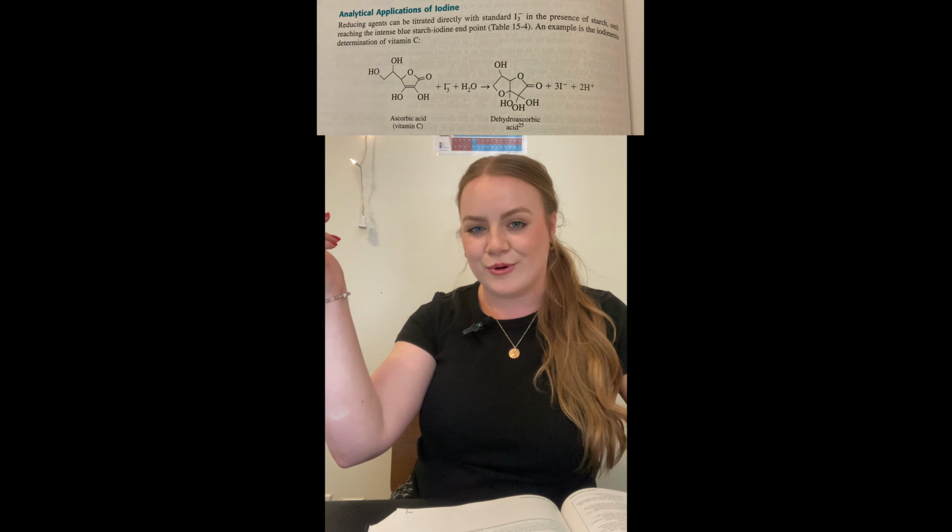The one I will be looking at today is with ascorbic acid, particularly L-ascorbic acid, and the titration of L-ascorbic acid with iodine. So what's really interesting is that this is really a redox reaction at the heart of what is going on here with the chemistry. So there's a component being reduced, and there's a component being oxidized. So the reducing agent is going to be the vitamin C, or the L-ascorbic acid, and the oxidizing agent is going to be the iodine in its triiodide form, which I will put in the video.